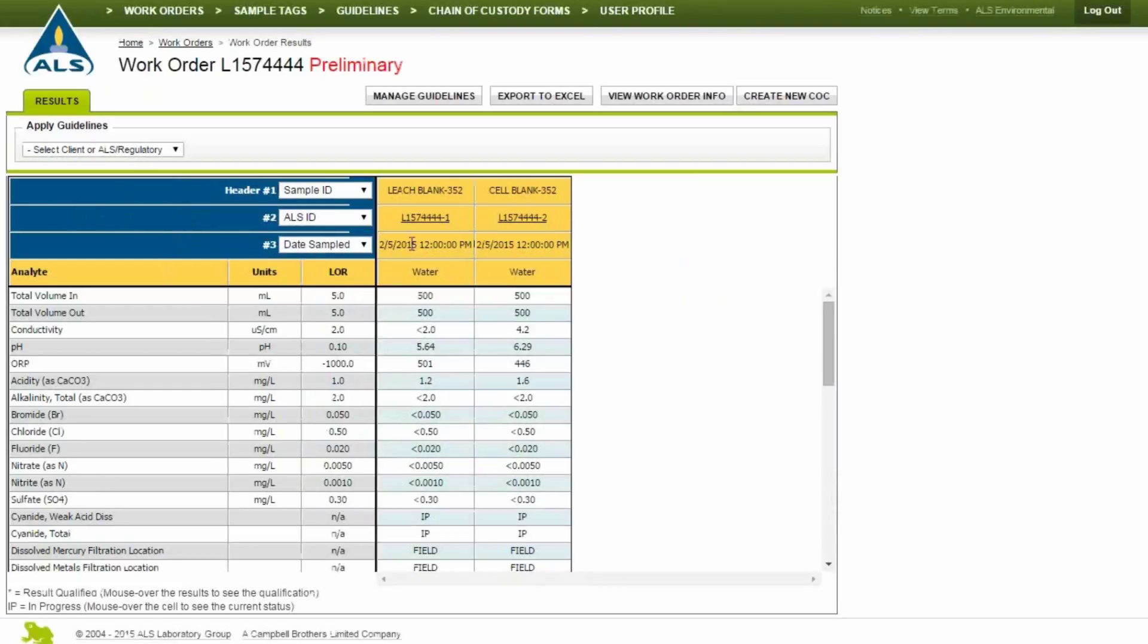Sample results and incomplete work orders are displayed as IP until the results have been validated by the laboratory. Mouse over the cell to view the current status of the sample in the laboratory.